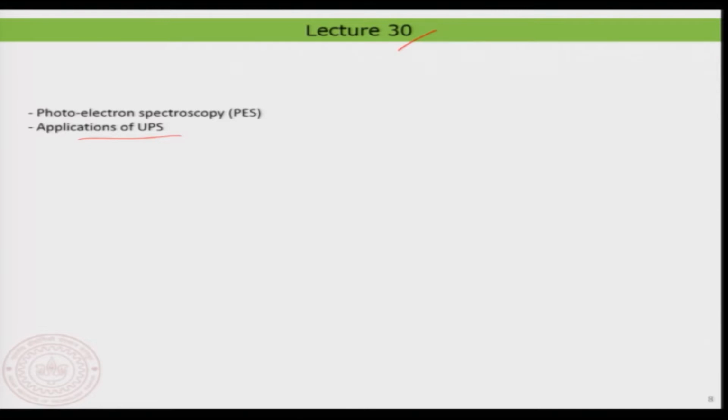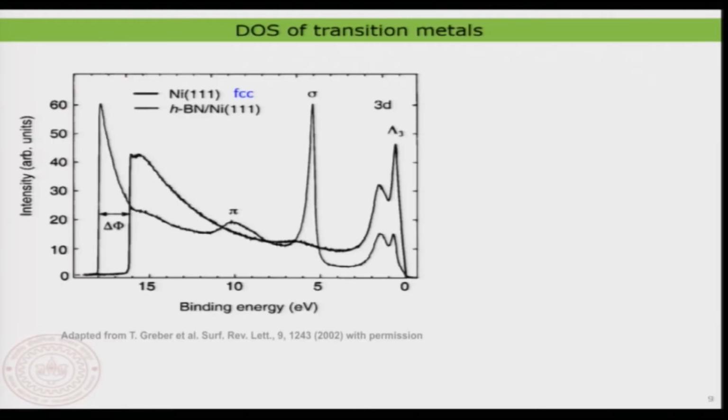It depends quite a lot on the excitation spot of the photon, and therefore you basically see data collected from several hundreds of micrometer square. That means it is averaged data rather than local data like we have seen in scanning tunneling spectroscopy. So, just keep that in mind. I will show you this with the help of an example, so you will understand it in greater detail.